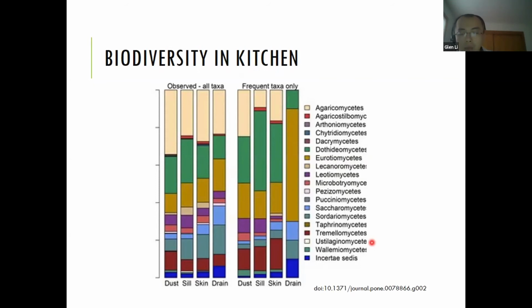But when we're actually doing the lesson, the molds can be quite diverse, and the colonies can be quite diverse as well. That's another way we can convey the idea that in our living environment, there are many different types of microbes present. You can see them on our bread petri dishes.